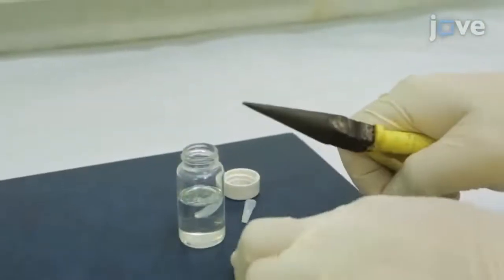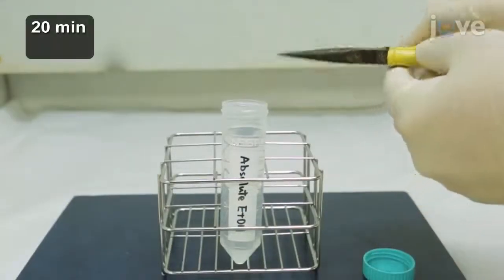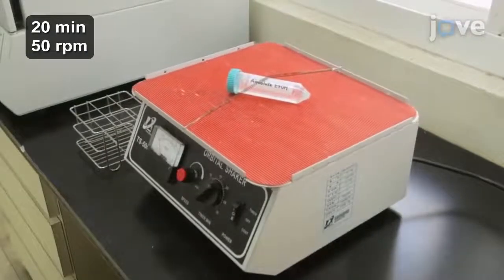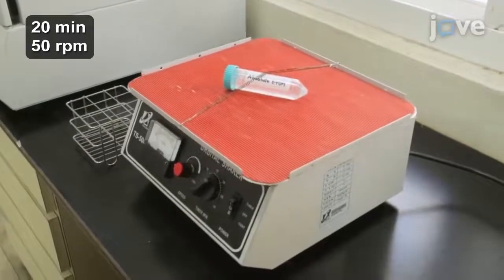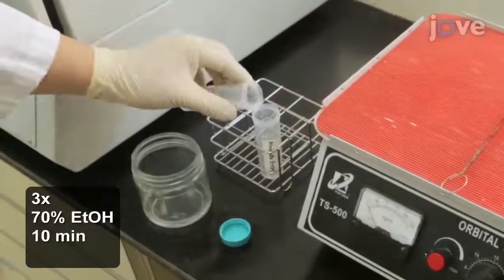Three days later, carefully remove the needles and wash them with absolute ethanol for 20 minutes with 50 RPM of agitation. Then, wash them three times in 70% ethanol for 10 minutes per wash.